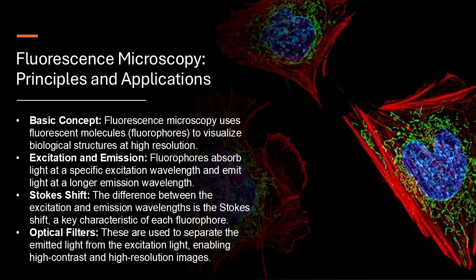There are even more advanced types of fluorescence microscopy that overcome some of these limitations and allow us to see even more. So more advanced, like what? This is already sounding pretty high tech. One of the most powerful techniques is confocal microscopy. Imagine being able to slice a loaf of bread and see all the details inside each slice. So instead of seeing the whole cell at once, you could look at it layer by layer.